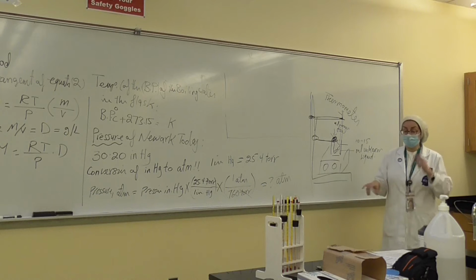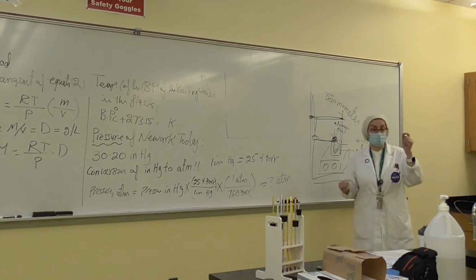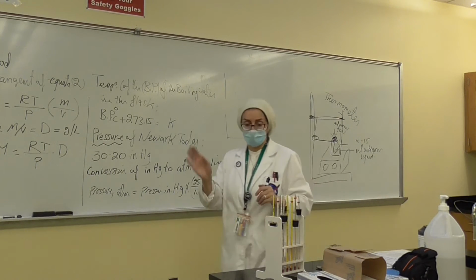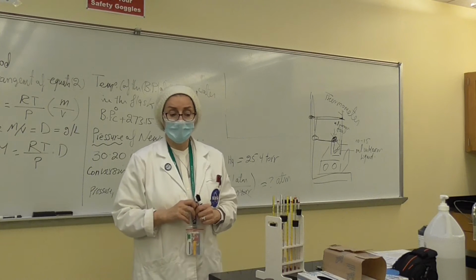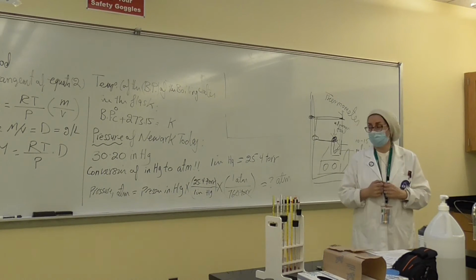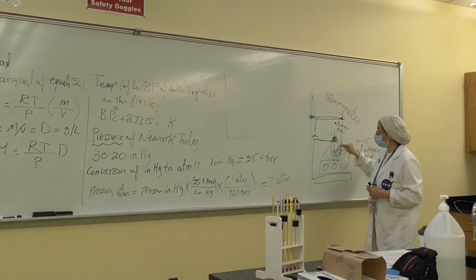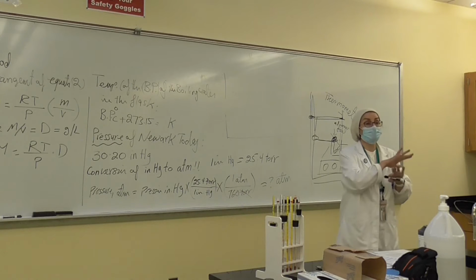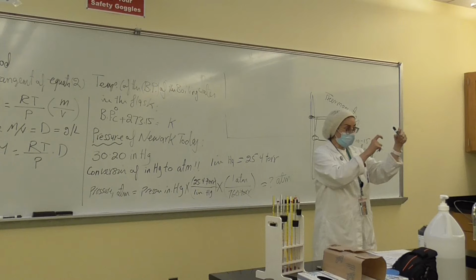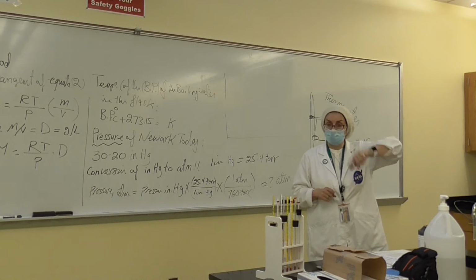And then we're going to start. Inside the flask also we need to have the boiling chip, so it doesn't splash. So we do have everything here. And then we're going to start heating. When you start heating, you are going to see that the inside is going to start bubbling until it is done, completely done. You remove it and put it under the tap water running, okay?